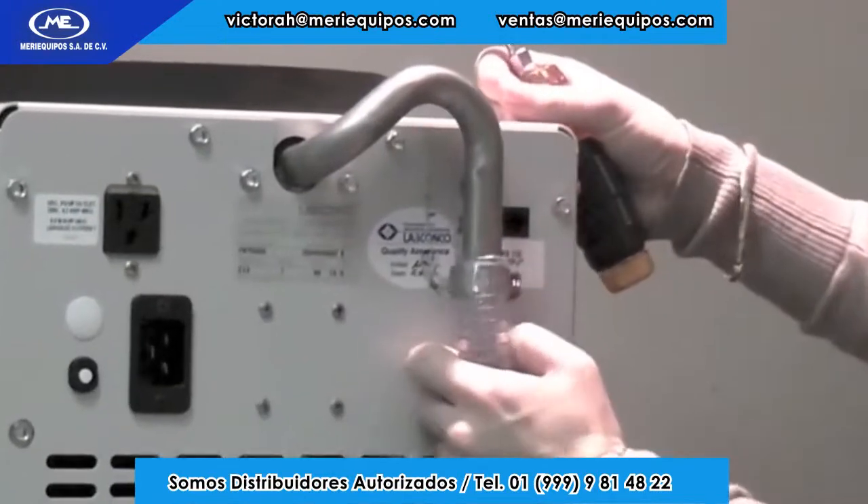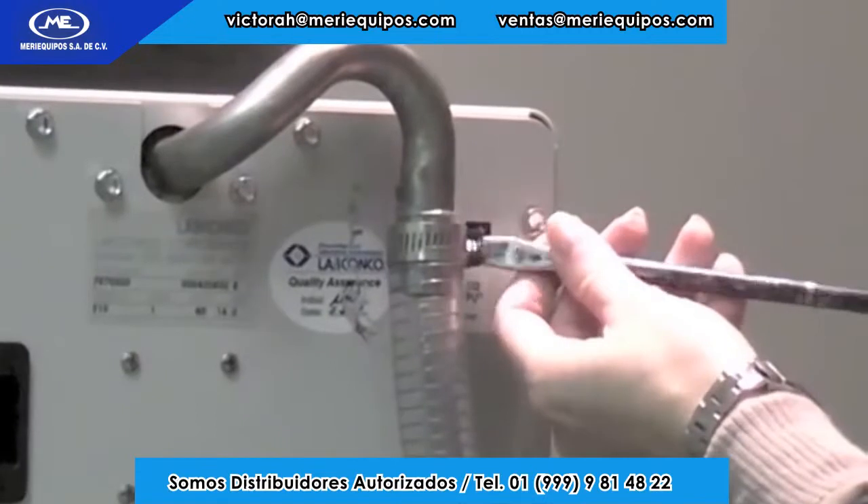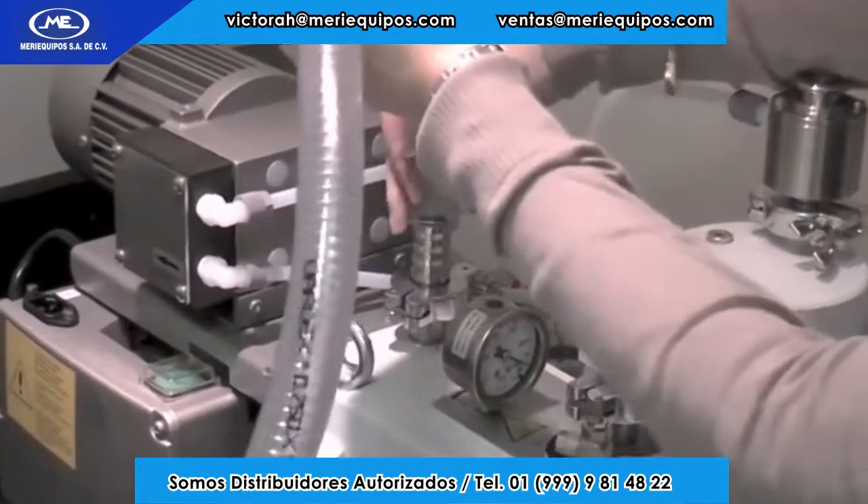First, attach one end of the vacuum hose to the port on the freeze-dryer and the other end to the inlet port on the vacuum pump. Clamp both ends securely.